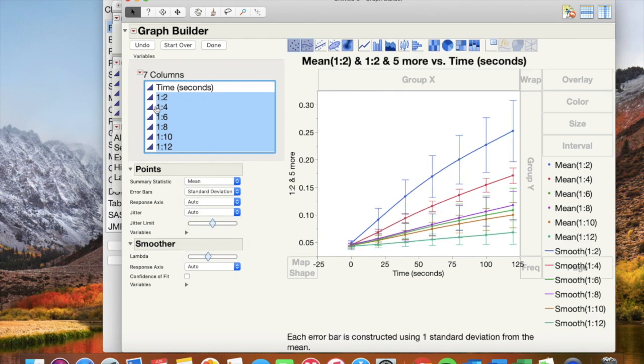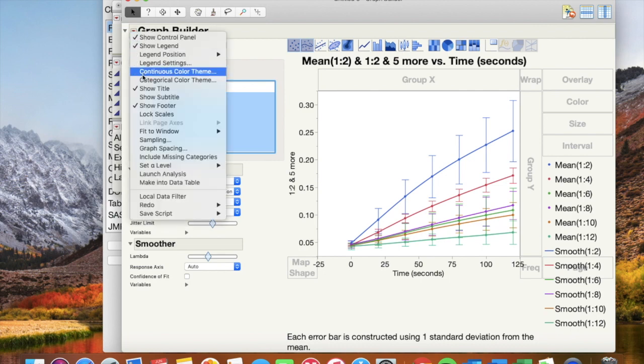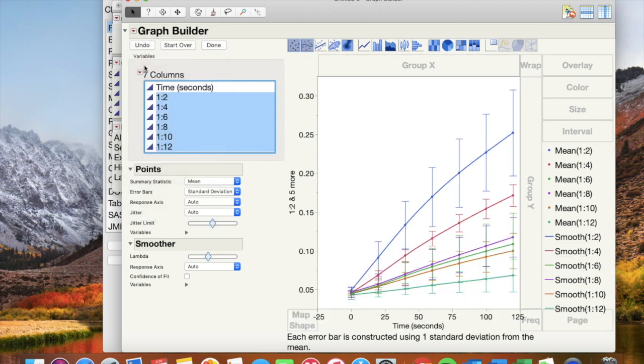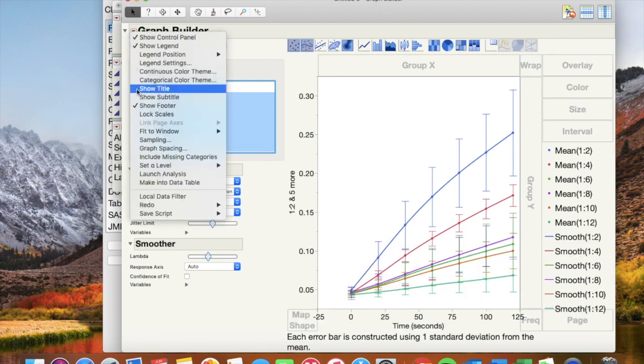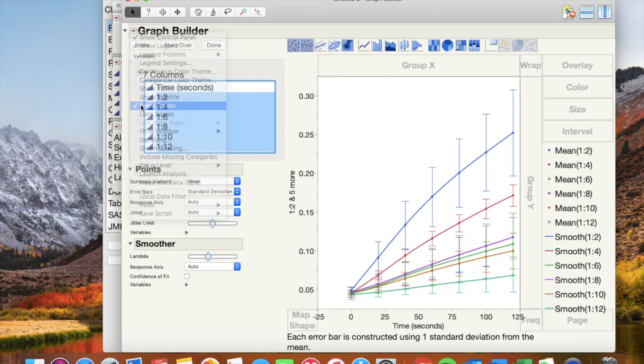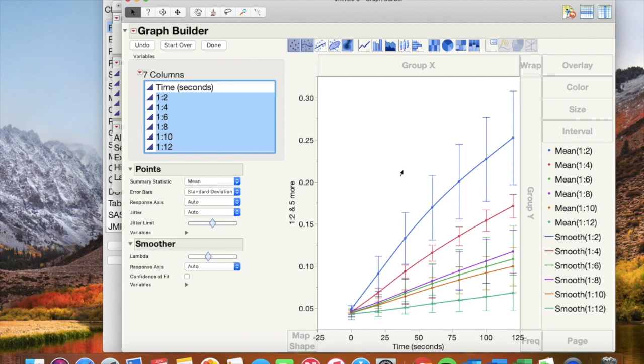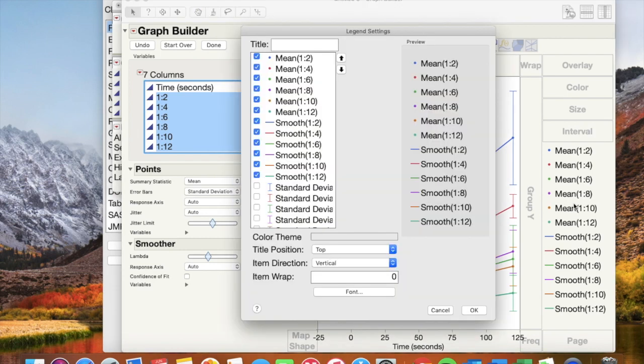On the drop down button next to graph builder, remove title and footer as shown. Click over the legend and modify it.